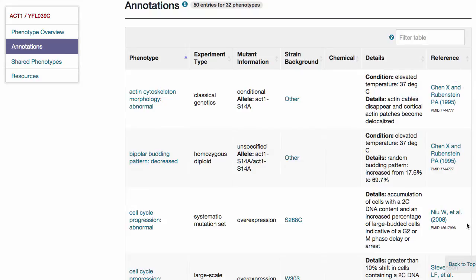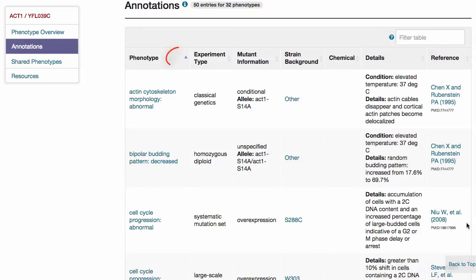At the upper right-hand corner of the table, the filter box allows you to type any text in order to display in the table only the rows containing that text. Each column header contains an up and down arrow that allows you to sort the table by that column in ascending or descending order.